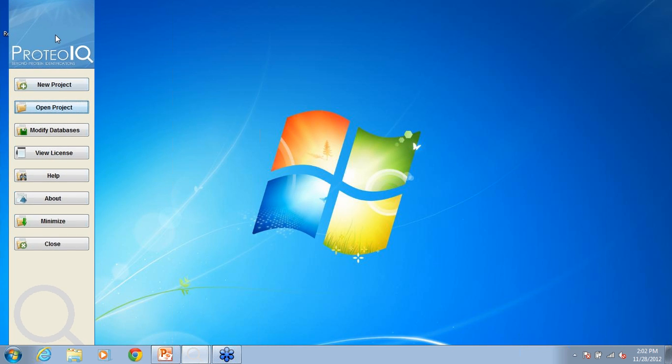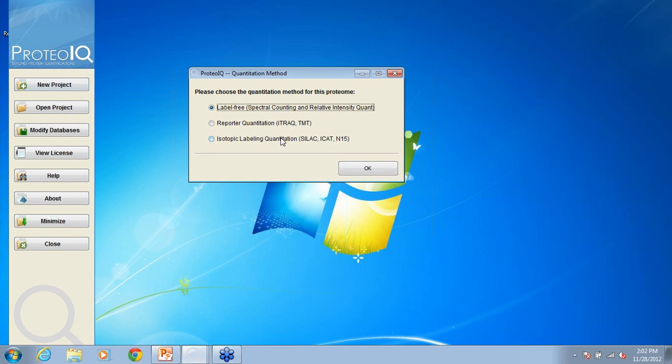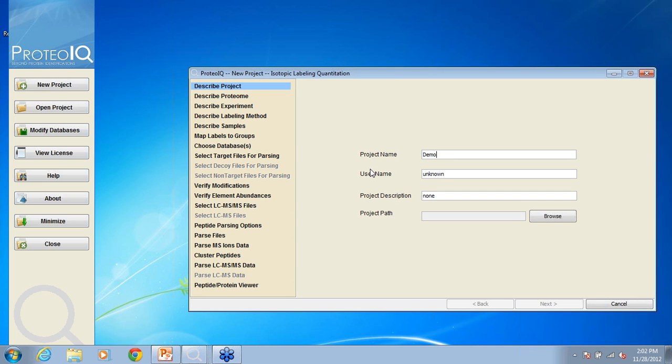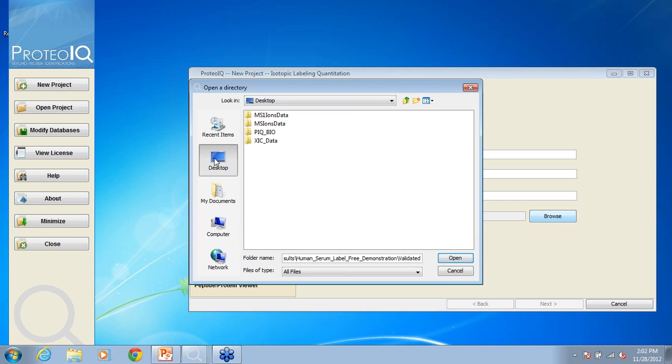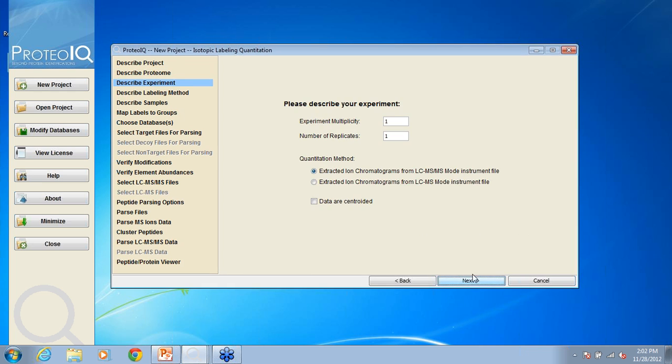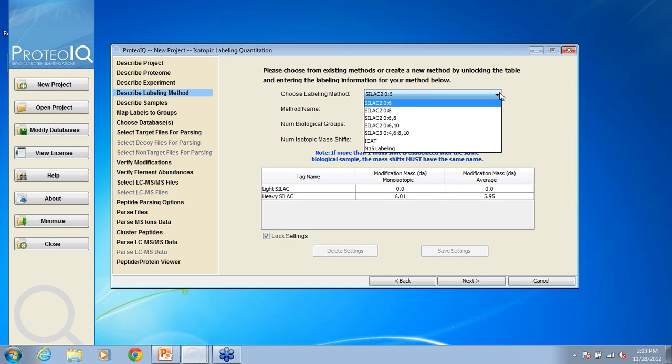All right, navigation panel, new project wizard. Dimethylation is going to happen under isotopic labeling. I'm going to zip through most of these screens and show you the key screen for setting up a dimethyl project. The key thing here is to specify the number of groups. So if it's a double label experiment, that's going to come later. This has to do with the number of replicate experiments you're doing. We won't talk about that here. Let's go forward. Okay, so here's the dimethylation setup.